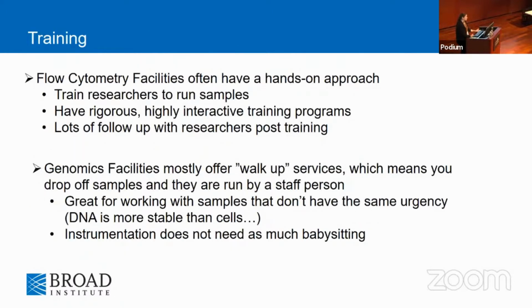Another thing that we're really good at in flow that we can apply to single cell is training. Flow cytometry labs are known for having really robust and rigorous training programs. This is what we do. This is a big part of ISAC and Cyto too, right? We talk about this all the time. Because we already train researchers to run samples, and it's extremely interactive and we follow up with people, you can pivot and offer this on the 10x side or other single cell side as well. And so that's what I do.